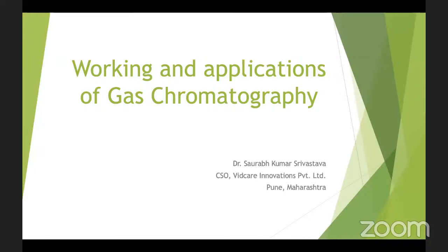Thank you, Dr. Mega, for your kind introduction. So, today the topic that we'll cover is chromatography, and more specifically, it's gas chromatography, its principle, working, and applications.